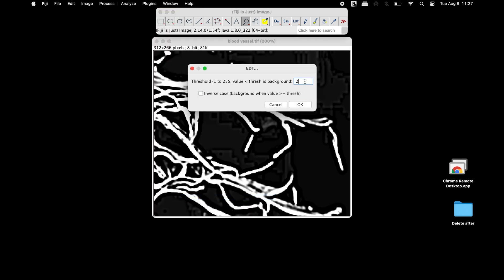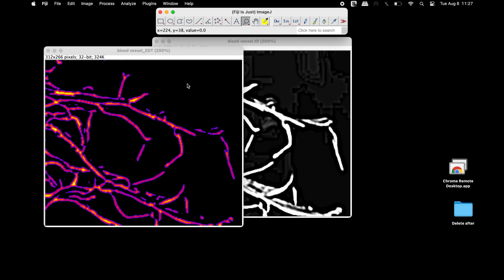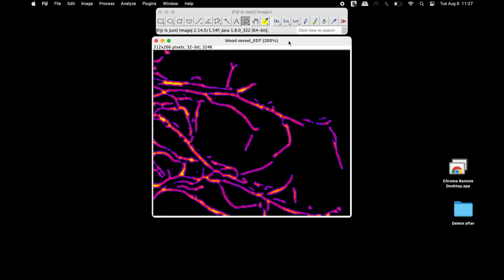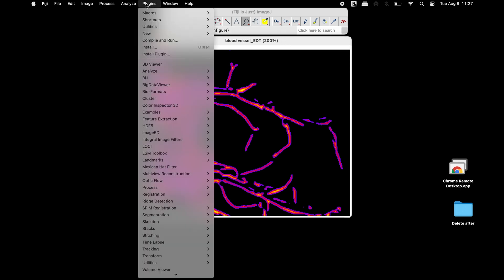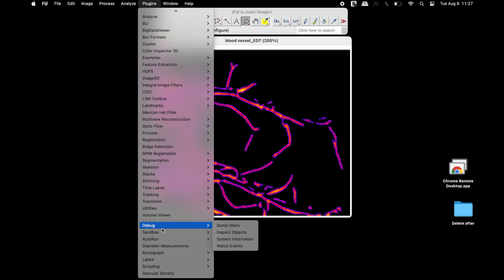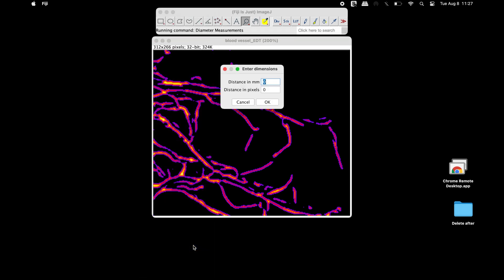Change the threshold — for instance, to 255 — and then click OK. The background noise now appears to be excluded. To measure the diameter, click on Plugins and scroll down to find diameter measurements. In the Enter Dimensions window, enter the distance in pixels, which equals the width of the image — 312 pixels. Next, input the distance in millimeters.